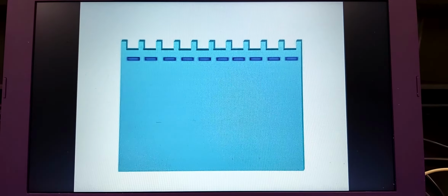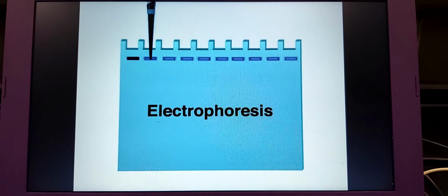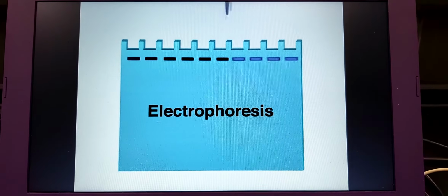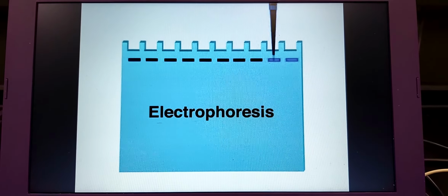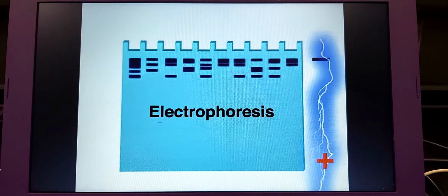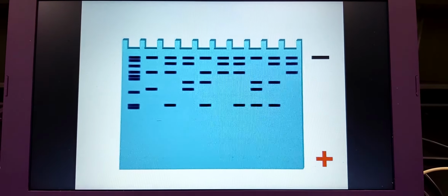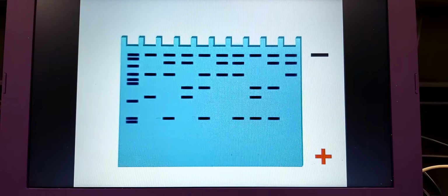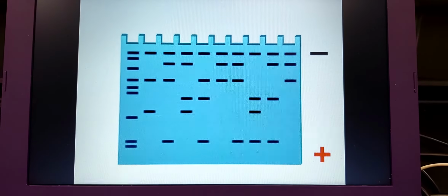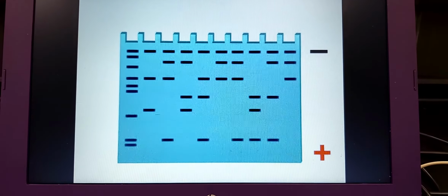Amplified DNA is run through an agarose gel by electrophoresis. PCR products are mixed with a dye and loaded into wells. DNA is negatively charged, and when loaded into the gel at the cathode end of the chamber, will move toward the anode end when current is applied. Larger DNA fragments cannot move as easily through the gel matrix, so will stay closer to the cathode, while smaller sequences move toward the anode end, resulting in separation of differently sized DNA into distinct bands.